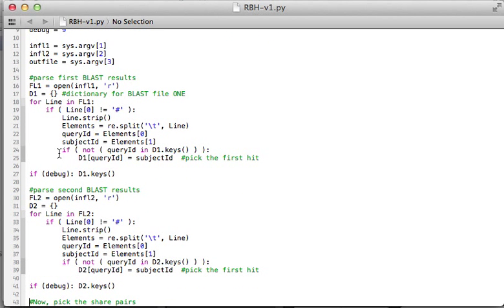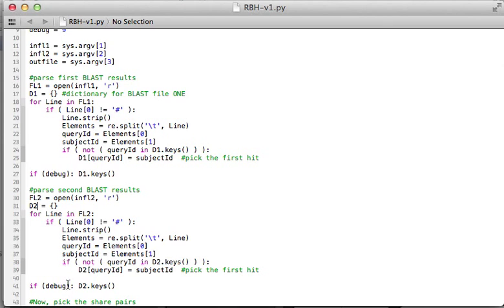Likewise, we can do the same thing for the second file, and this time I'm putting this into the second dictionary. Everything the same, except I changed this one into D2.